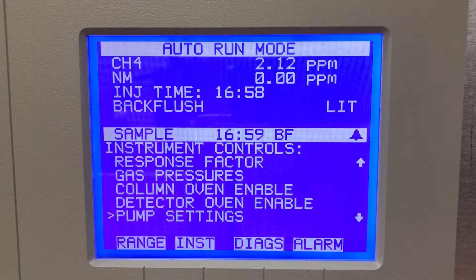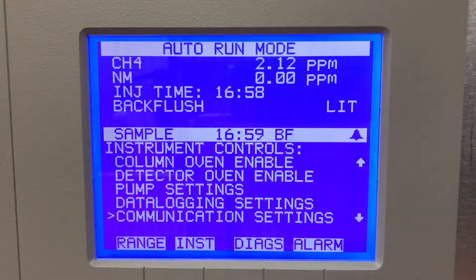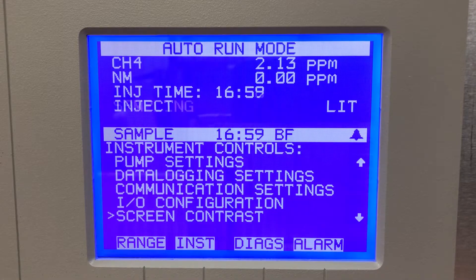Column oven enable, detector oven enable, and pump settings. It also has a data logging feature — this unit does have an internal data logger with a one-minute resolution. Communication settings: it has TCP/IP ethernet on this unit. IO config for analog or if you're using 4 to 20 milliamp output, and screen contrast.